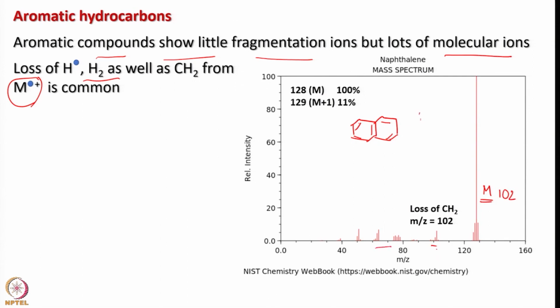So this is not 108, this is 128. Yeah, so then loss of CH2 will give you 14, 102. You can also see here some fragments and sub-fragments.